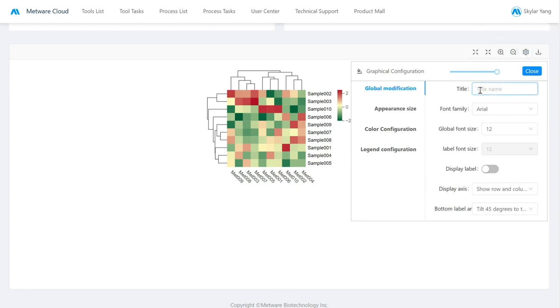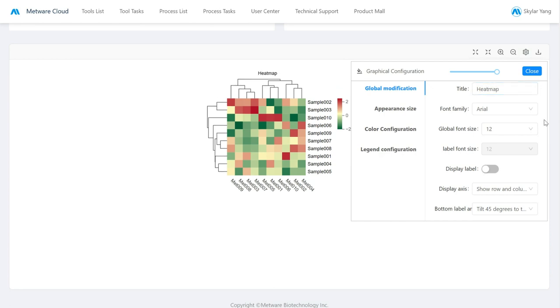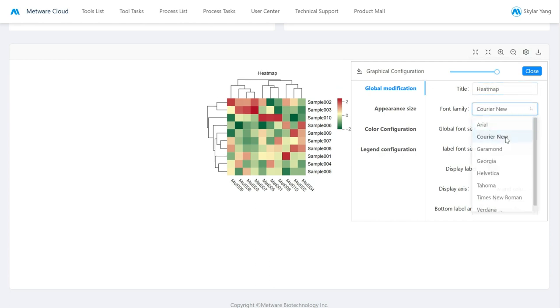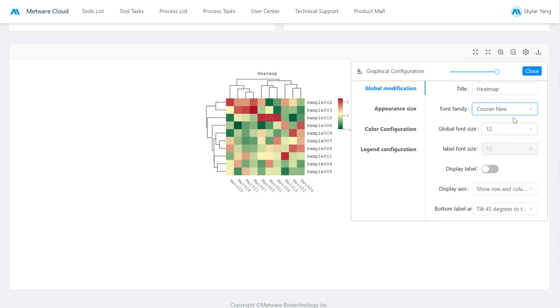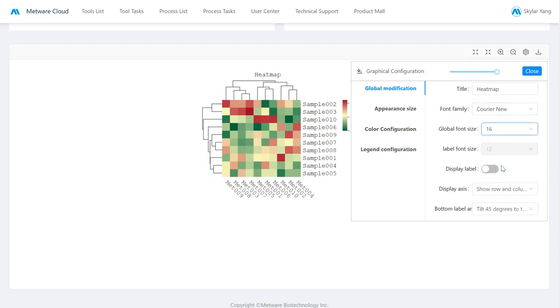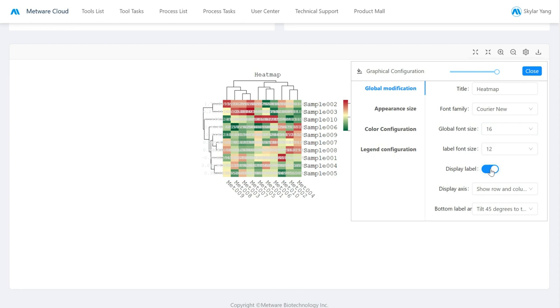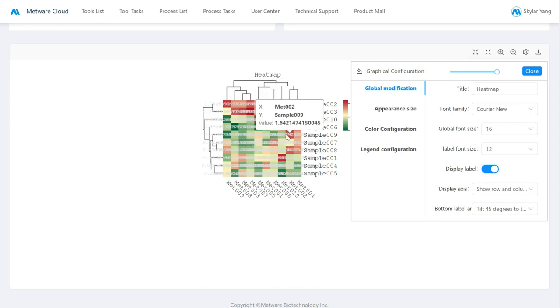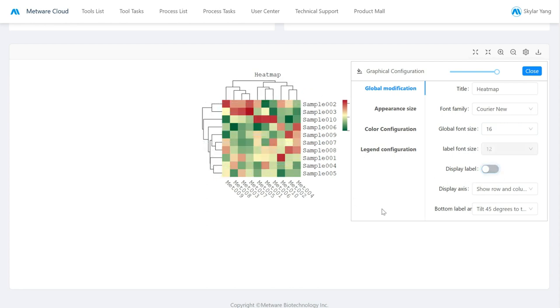So here we can set the title. And we can change the font. We can add display labels, like here are not really readable, so I will remove them.